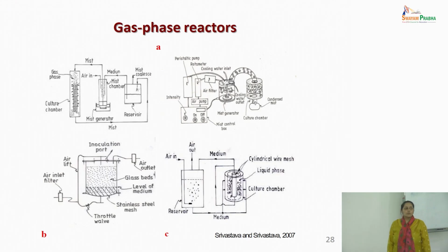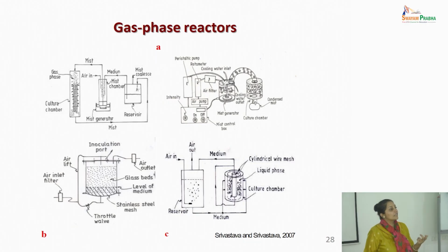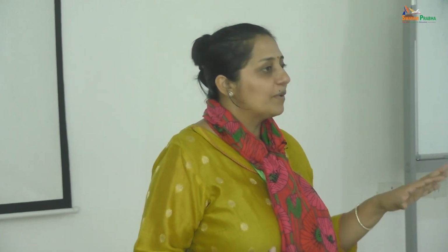Droplet. So now one of the most popular designs is mist bioreactors, which you will come across in gas phase reactors. We ourselves also worked on it, where people manipulate the size of the liquid droplet. So people use ultrasonic transducers to convert the liquid media to a cloud form. So what all factors have to be optimized? The rate at which, the cycle time. How many times are you exposing the media droplets to the biomass in one go per unit time?